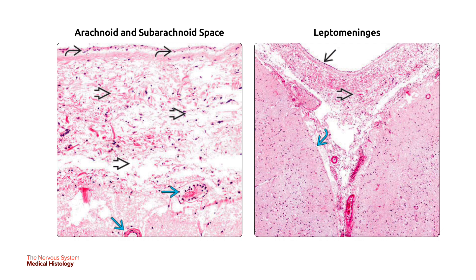On the left is the subarachnoid space — a potential space below the arachnoid membrane occupied by CSF. Superficial cerebral vessels and arachnoid trabeculae, which are connective tissue fibers between the arachnoid and the underlying pia, are also shown. On the right is a low-power view illustrating the relationship between the arachnoid — a thin layer of mesothelial cells — the subarachnoid space, and the pia mater — the delicate membrane covering the brain, adhering to your gyri and sulci.